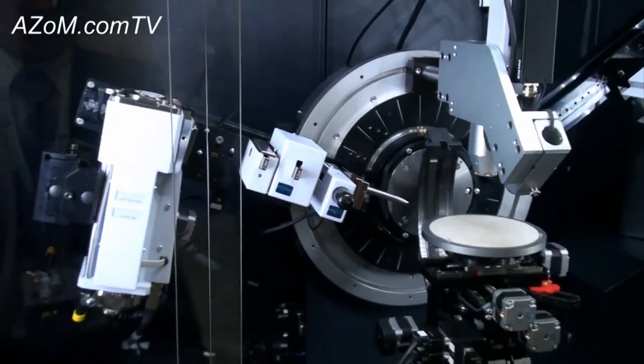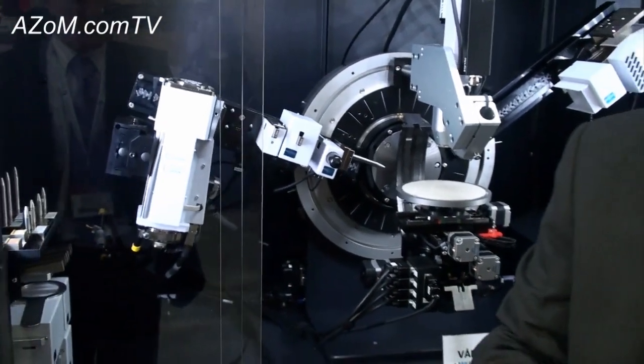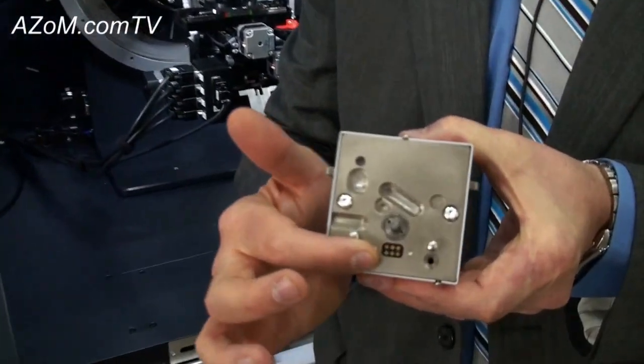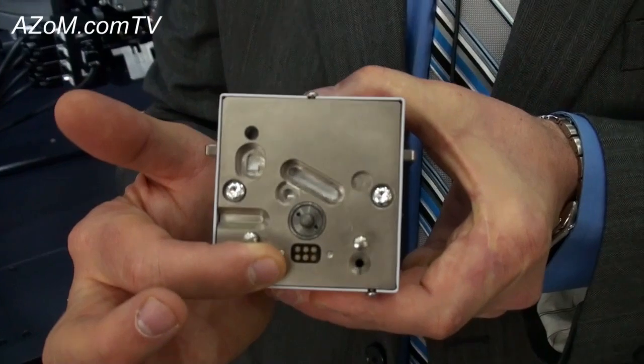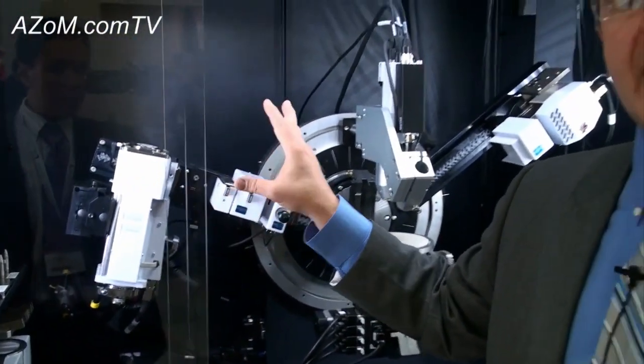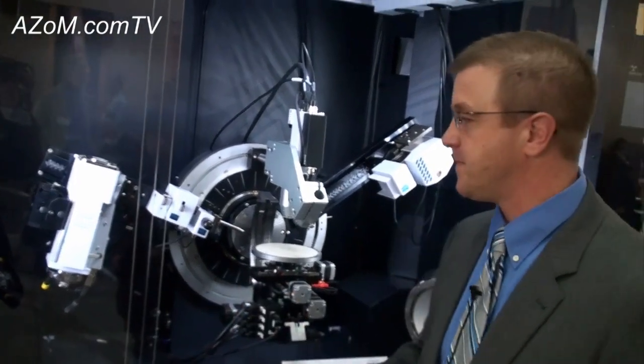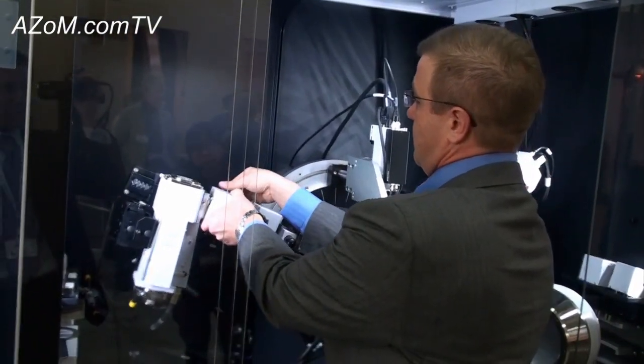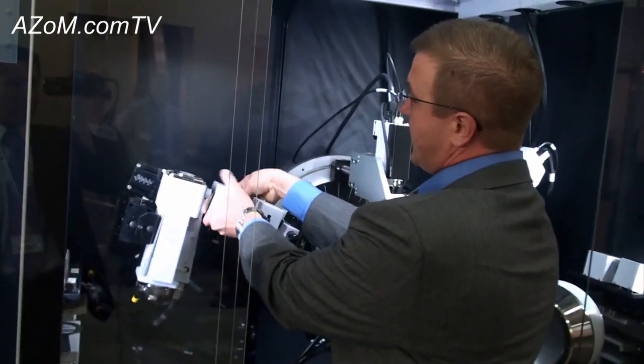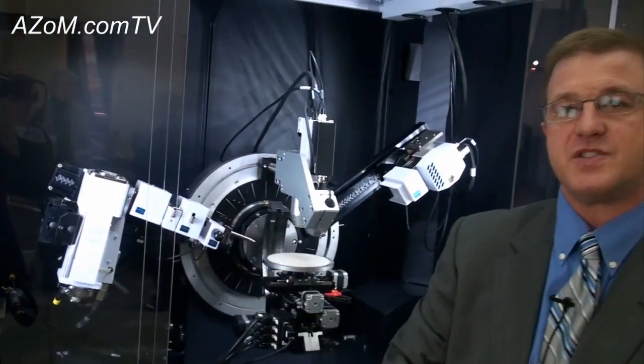The other really nice feature of the system is that every single component has an optical key within the system. That means that the system knows what's mounted to it at any and all times. And putting a component back is that simple. Again, zero realignment.